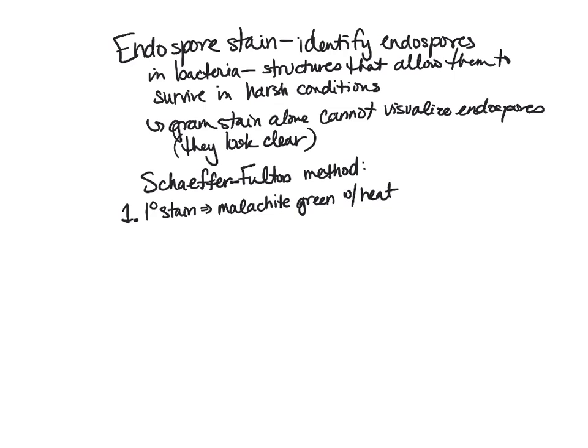Similar to our acid-fast stain, we're going to let it sit on a beaker. We're going to allow that heat to push that green color into the endospores.